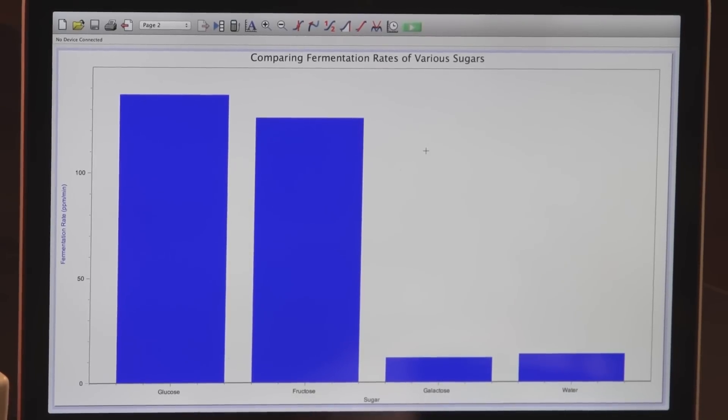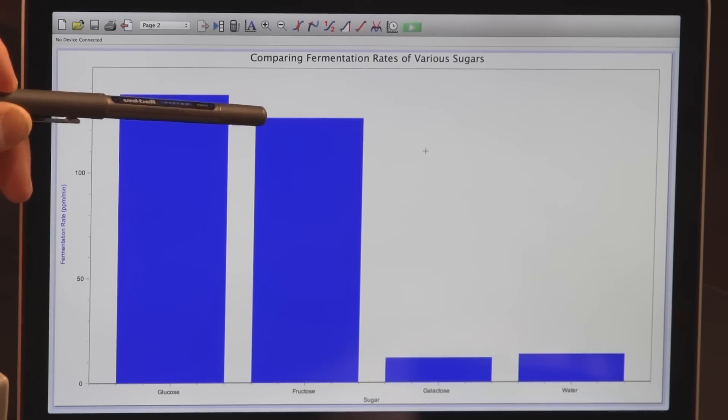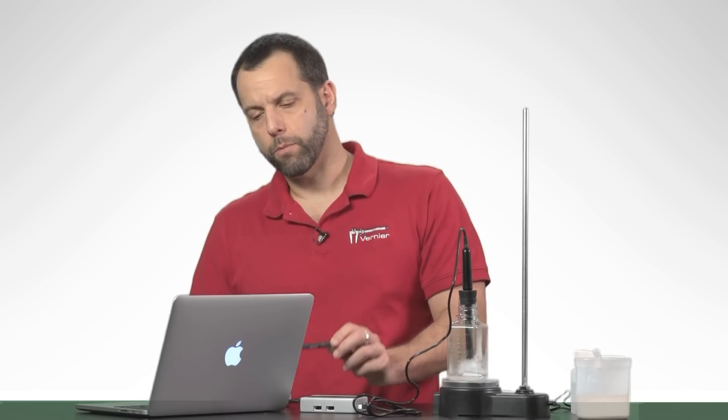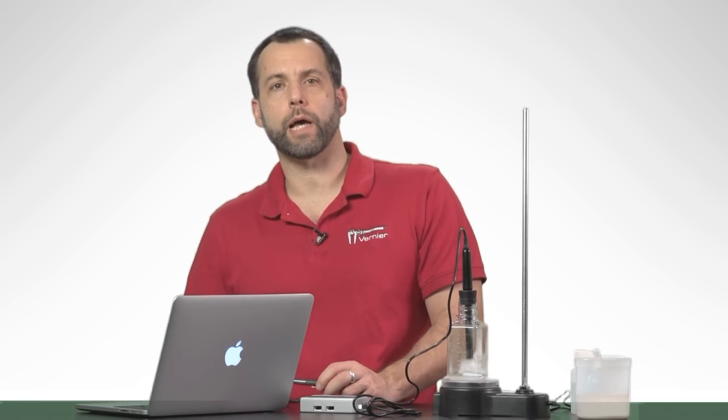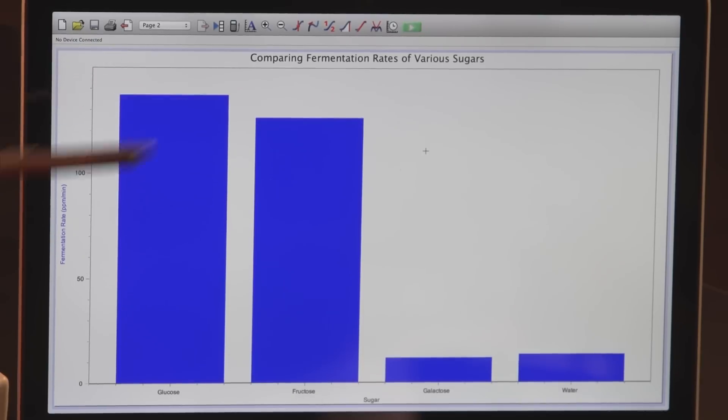So this is just a bar graph that shows the fermentation rates of a sample of yeast to glucose. You can see that the yeast really like the glucose—the rate that they can produce ethanol. I've converted this to minutes, so you just multiply the rate that I just showed you by 60 to get it in ppm per minute. So the fermentation rate is well above 100 there. Now you can see fructose is actually close but not quite as good as glucose. That's probably to be expected. You might want to run this experiment several more times to really see if there's a statistically significant difference between these two.